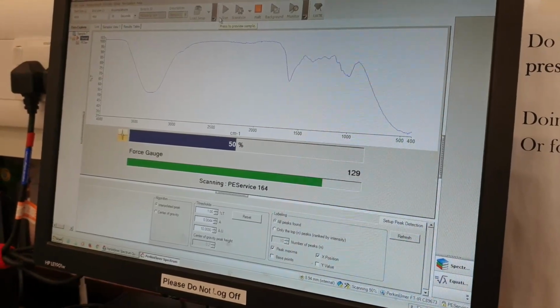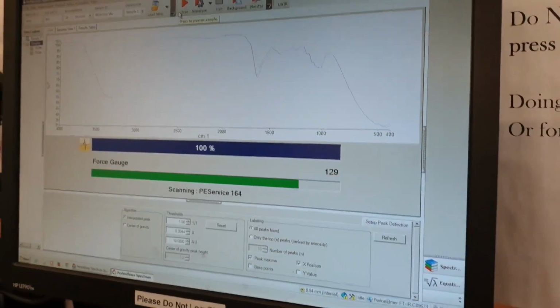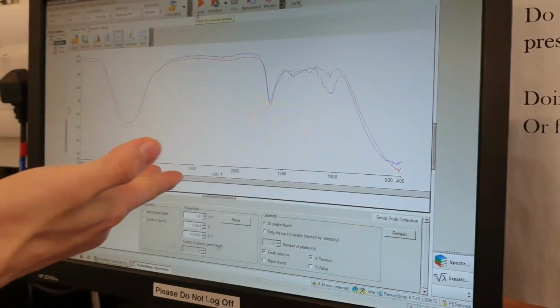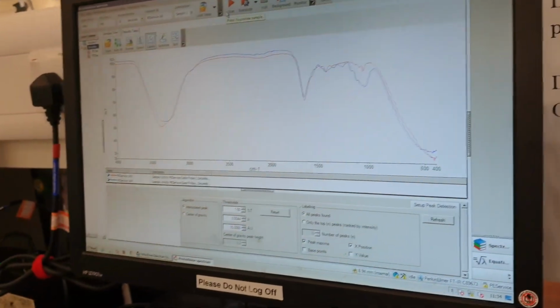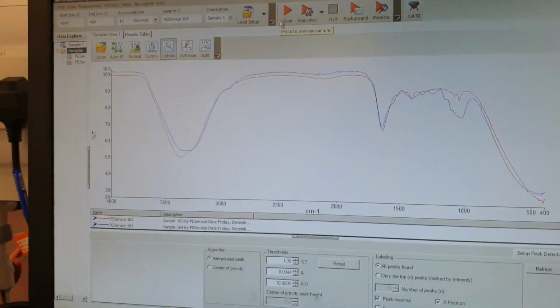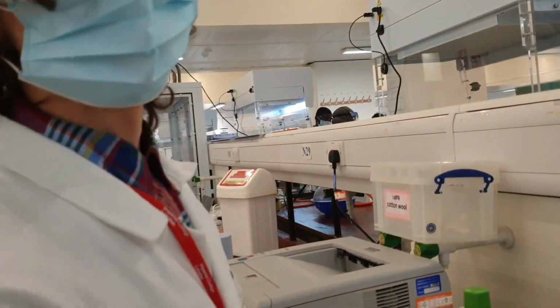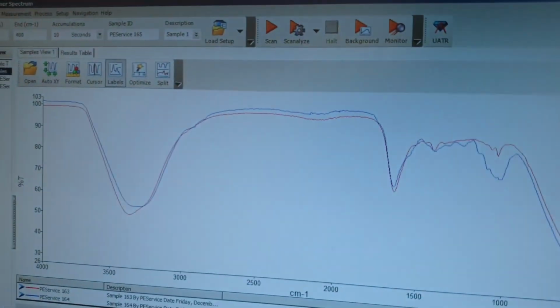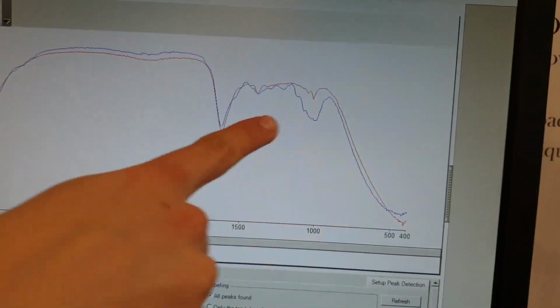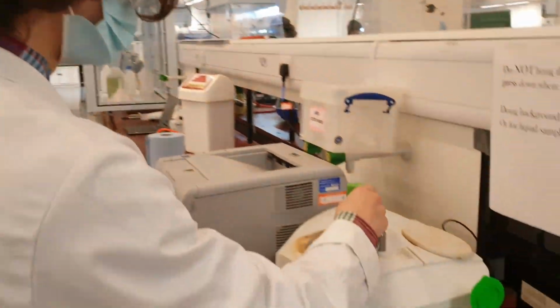Right, so there's our courgette spectrum. We're doing IR on courgette. And as you can see, it's almost identical to soy sauce. Right, we've done some important science here and concluded that courgette is roughly the same as soy sauce. As you can see, it's just a slight difference in peak height here and here, which is the entire reason they taste different, and that's it.